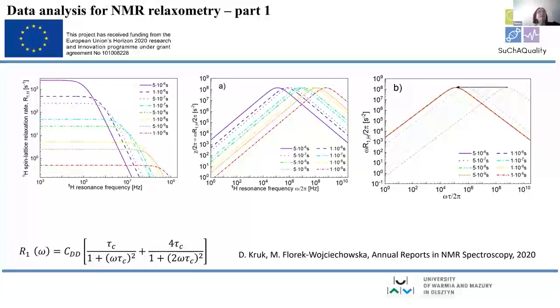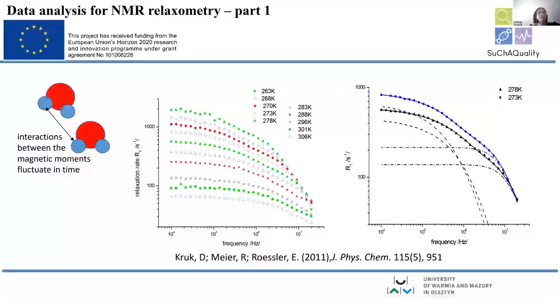Here one can again use our intuition. Correlation between something, yeah? So there is an event, and whether it has any influence on the next event. Whether 2 things are somehow correlated. Here, what we correlate is a position, maybe not exact, generally speaking, a position of a molecule. For instance, if we look at a rotating water molecule or any other molecule, imagine that here we have a direction of the external magnetic field. And we draw a line between the 2 protons, the 2 hydrogen atoms. And this line is called the dipole-dipole axis.